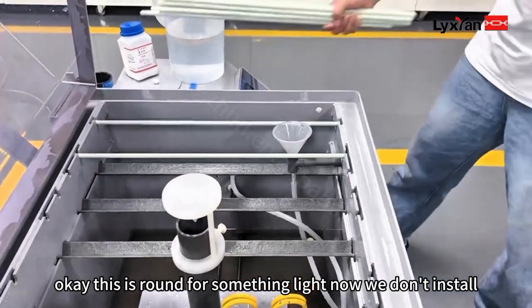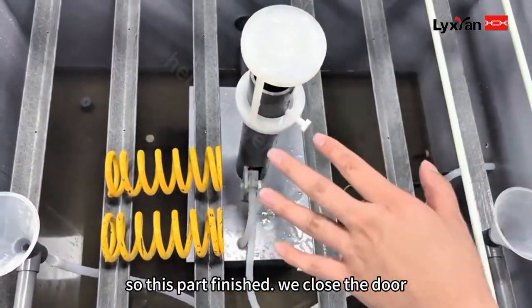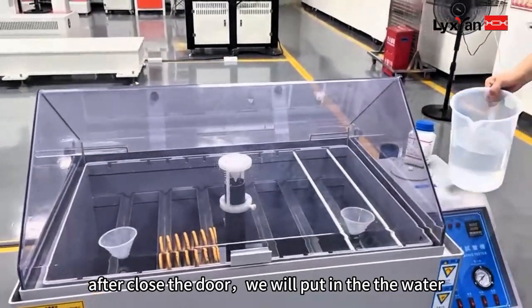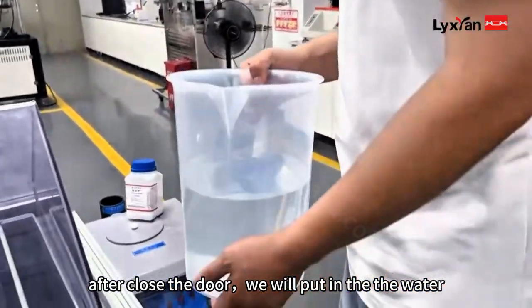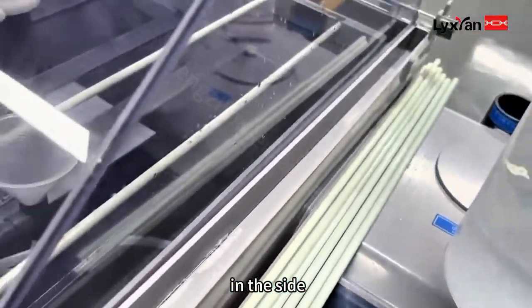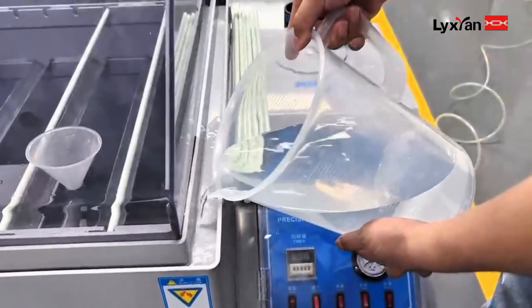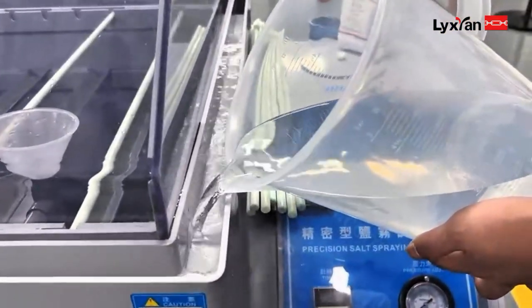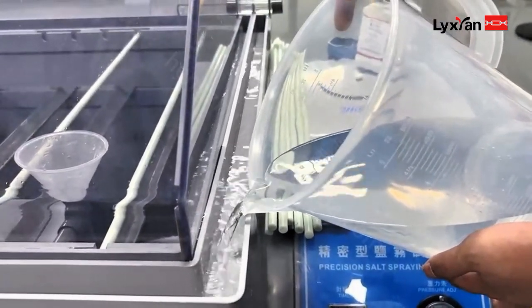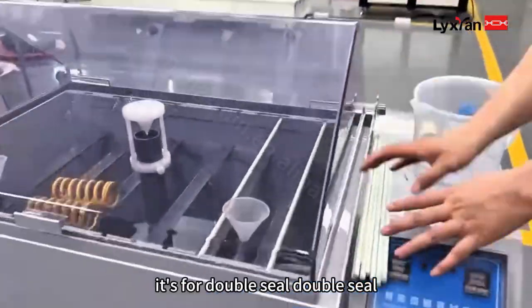Now we install the door. After finishing, close the door. After closing the door, we will put water in the side channel. Why do we put water here? Because this is for a double seal.